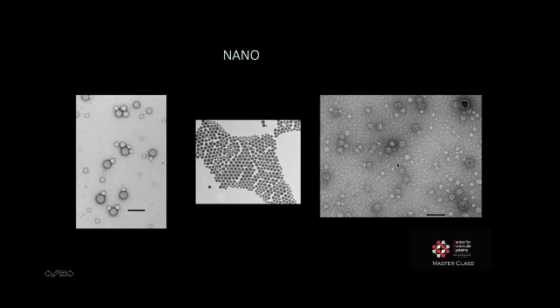You can also look at the purity of purified organelles. In this case, there's a bunch of vesicles that have been purified from a cell prep, and we can look at that very quickly and easily to see the quality, the concentration, cleanliness of the sample.